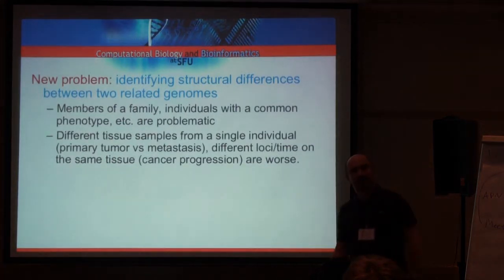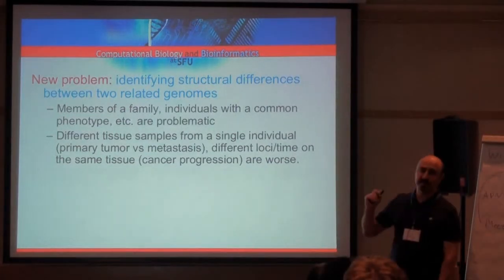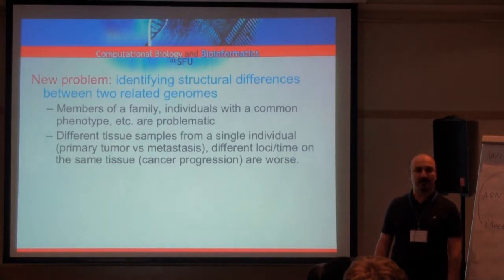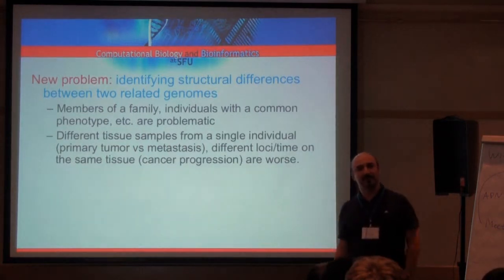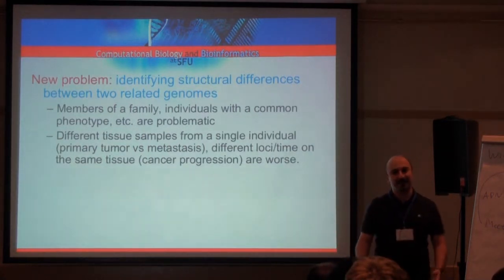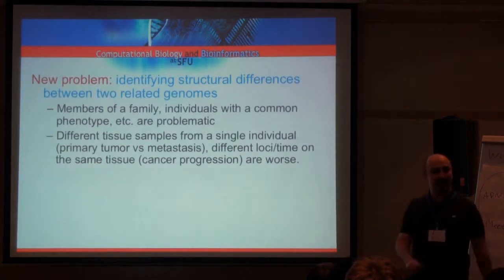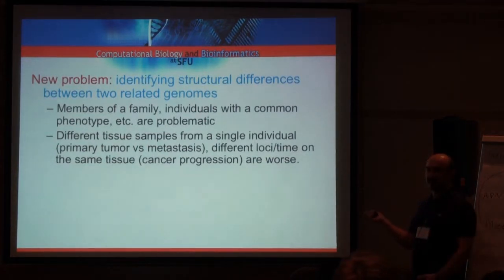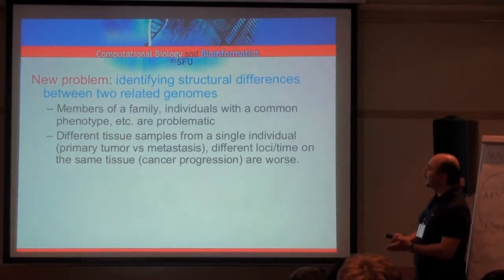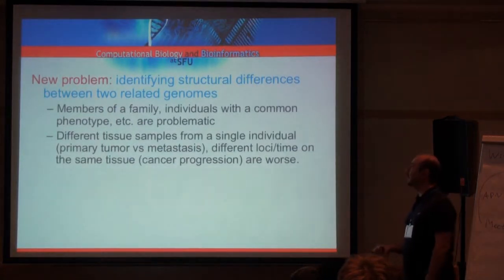So I was looking at the flight times from Istanbul to Moscow and Istanbul to St. Petersburg. Roughly, they're both 3 hours. So I can deduce that Moscow is St. Petersburg. Then when I arrived in Moscow, I figured that it's not exactly the case. You still have to fly for an hour and a half. And the same situation exists here. The reference genome cannot be used as an intermediary exactly if the 2 genomes are very similar.